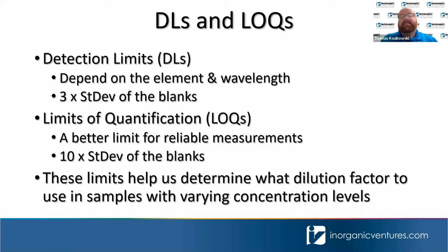But a detection limit's defined as 3 times the standard deviation of your blanks, and the limit of quantification, or your LOQ, is 10 times the standard deviation of your blanks. And I will say that this is a much better limit if you're looking for reliable measurements. So we've got another slide that shows what these limits are.